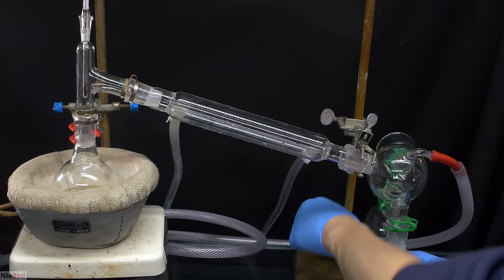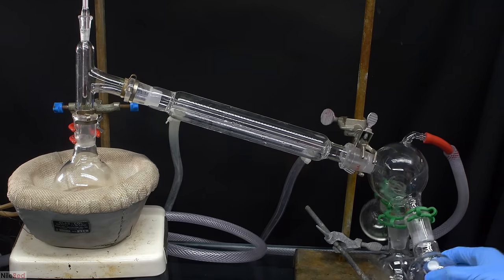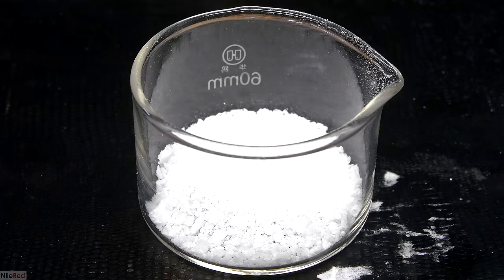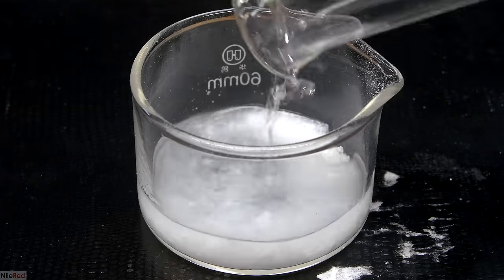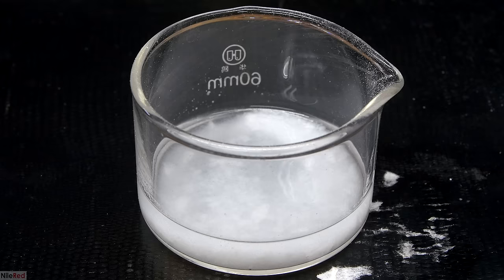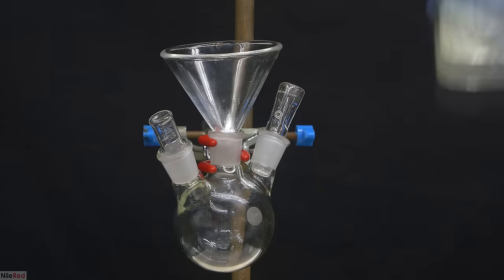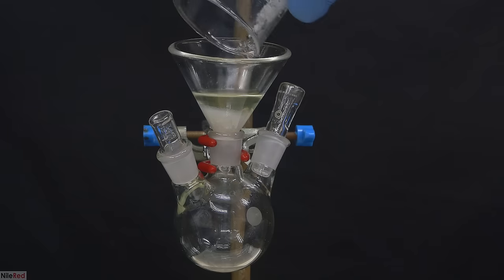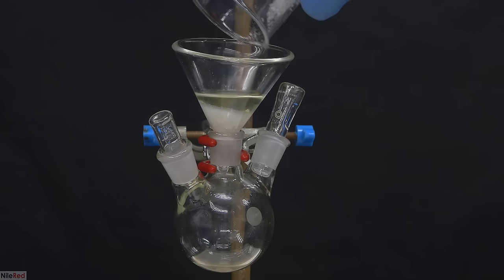Today we're finally making 1-octen-3-ol, which is something I've been trying to make for a while now. It's sometimes used as an artificial mushroom flavor, but what I find interesting is that it's a chemical attractant for biting insects. It's naturally present in both human sweat and breath, and this is one major way for insects like mosquitoes to find us.